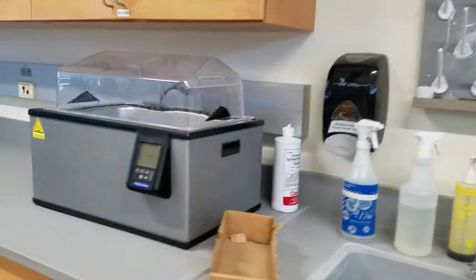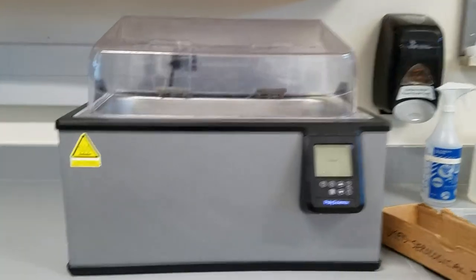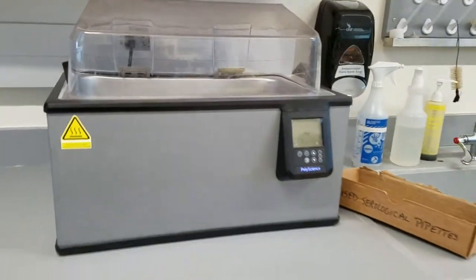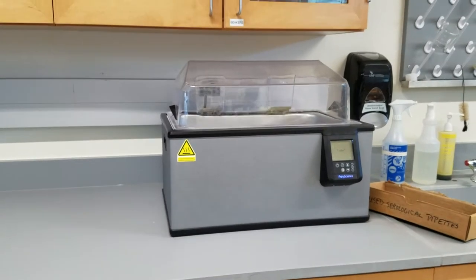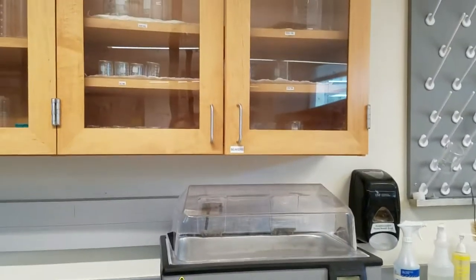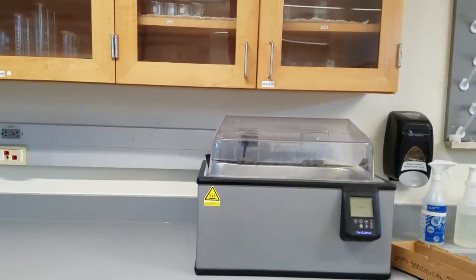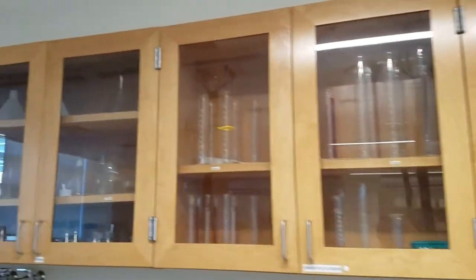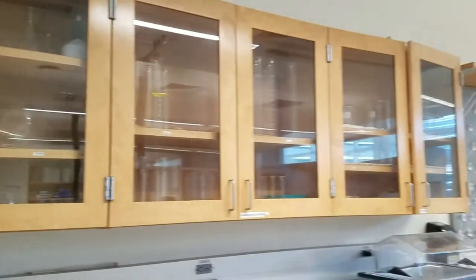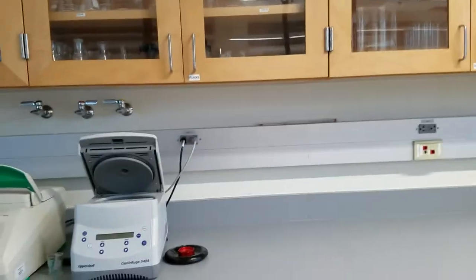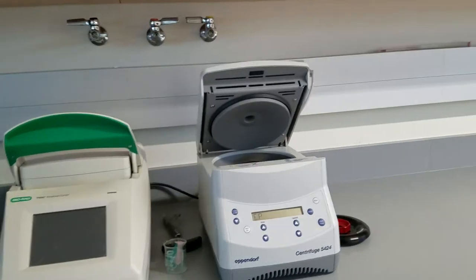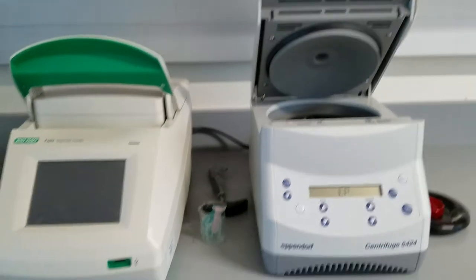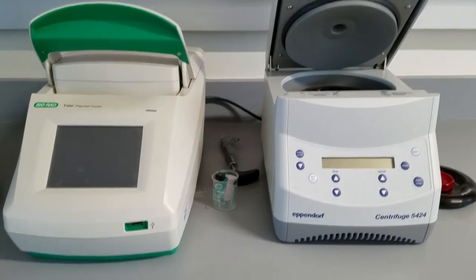Then I have a water bath. This is what I use to warm media cells and also to incubate our mixtures - things that we need to gently warm at different temperatures and keep at a constant temperature during our experimentation, such as protein or nucleic acids. We have glassware, all types of different glassware available for the students to use in the cabinets. This glassware is taken as needed by the students themselves, and then we wash it at the end of the day.